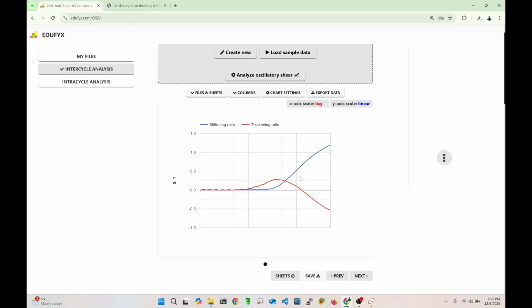So now you can see the benefit of the stress filtering. And why this happens is because the noise that we saw previously is because of differentiation noise, I believe. So because differentiation is highly affected by noise, so you probably want to do stress filtering for the smaller strain amplitude, and then leave the higher strain amplitude unfiltered. So for example, you can export this data now. You know you filtered the strain amplitude, but you are interested in only.